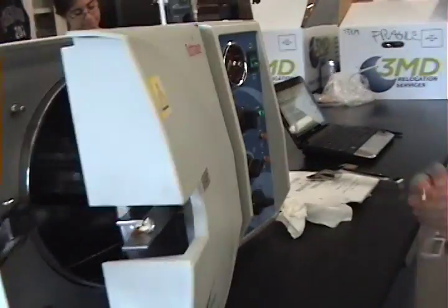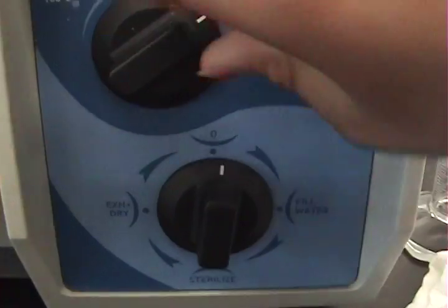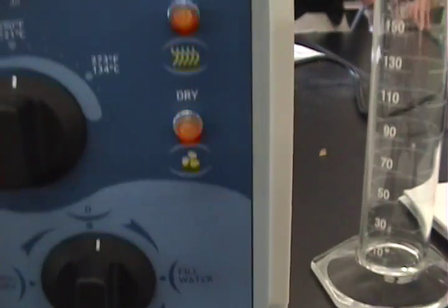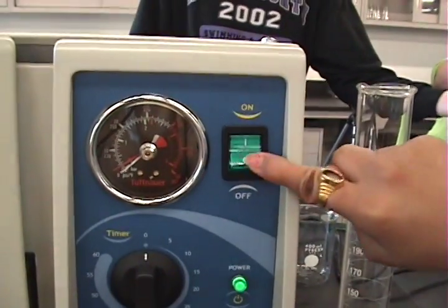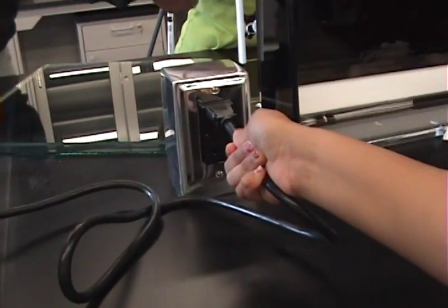Before you close the autoclave, turn all knobs to zero. Make sure all the lights are off except for the power light, which will turn off once we turn off the autoclave. Now turn it off by switching it off — the light should go off. Pull out the plug so that you don't electrocute yourself.